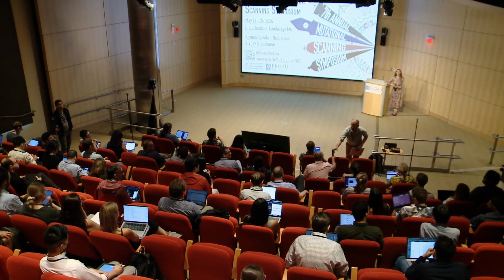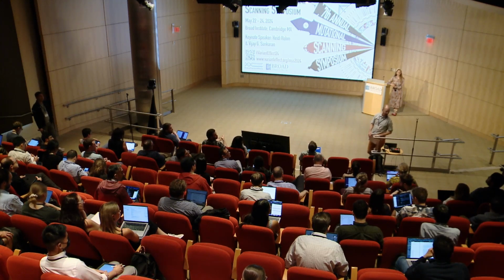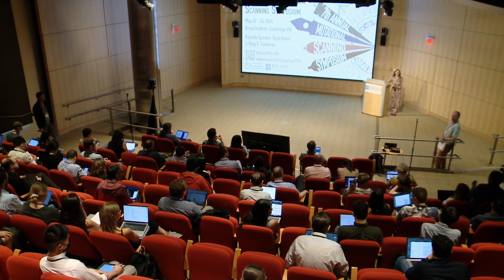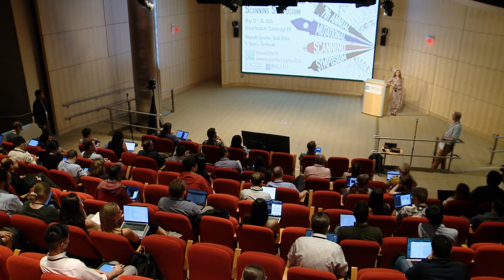I was wondering, what kind of tool would you recommend for the design of the guides for the base editing? If I had, for example, 1,000 sites in different parts of the genome that I wanted to edit, is there a tool that could help me with designing the guides? So we have an in-house script that allows the user to input the isoform of interest and define the features that one would wish to select as a base editor specification.